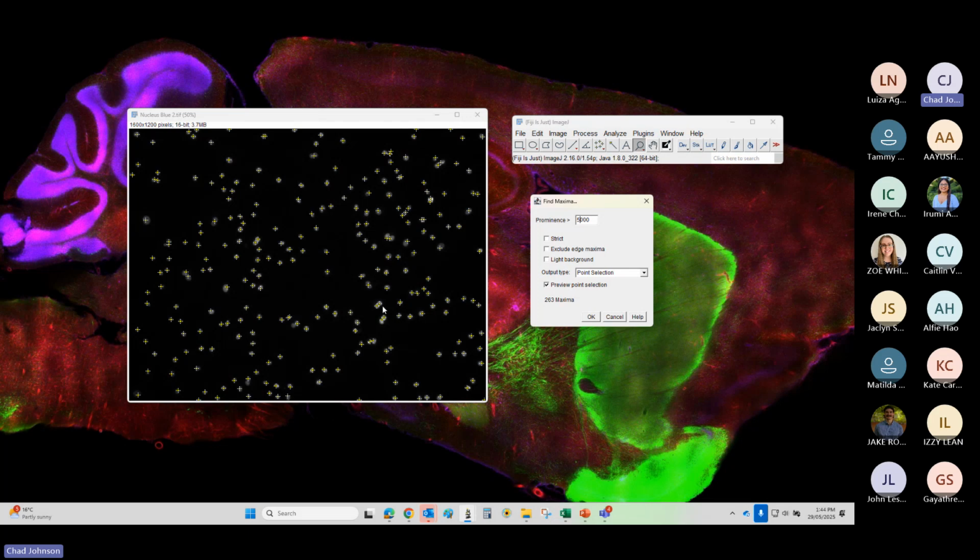So this would be what we would do instead of the histogram. No, the histogram, the watershed, I should say. So the watershed works in a similar way, but we're going to use this as a way of doing that as well. I'm just going to see if I can get a better value. All right, I'm going to stick with 5,000. 5,000 is pretty good.